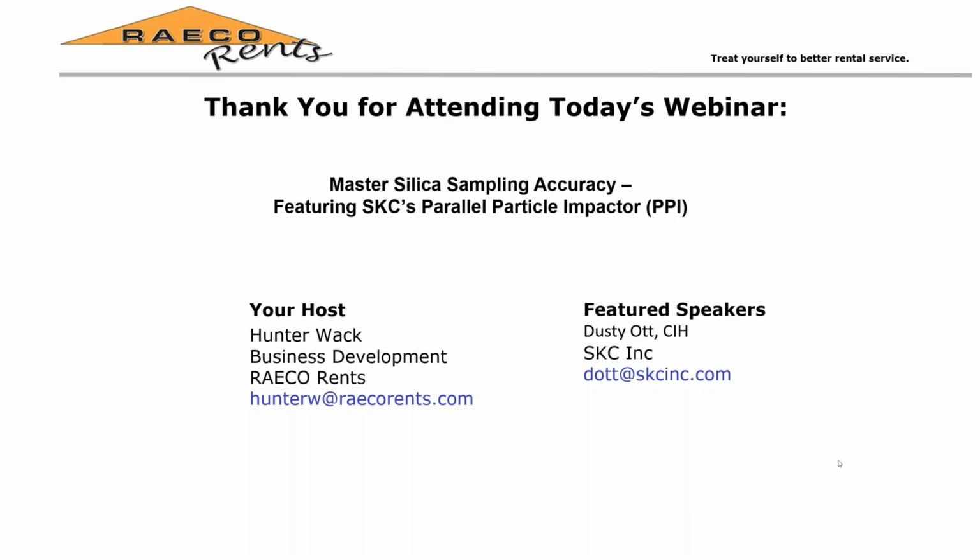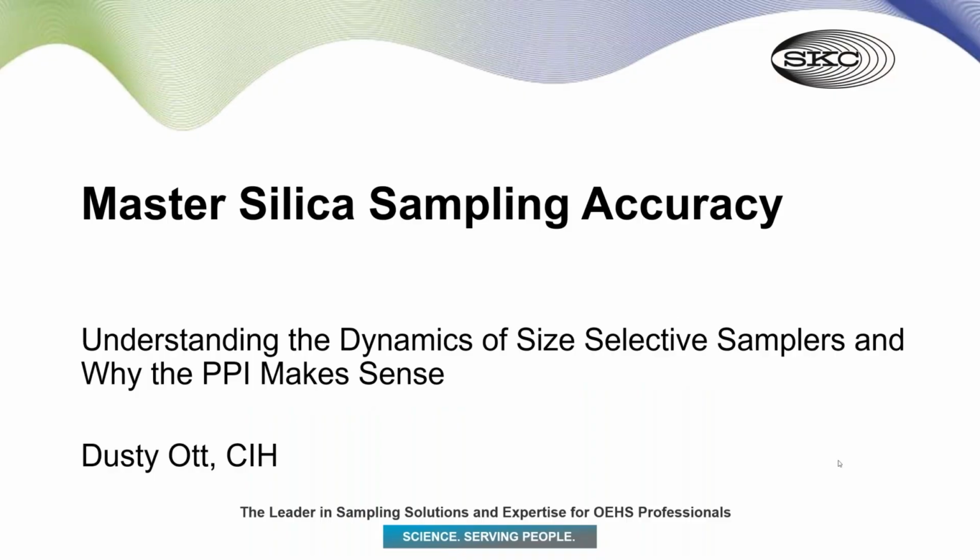Like Hunter said, we're going to be talking about the PPI. We're going to talk a little bit about cyclones as well and how they differ, where they're good, where they're not so good, what is going to be the best choice for you as you decide moving forward in your silica sampling. And so, kind of like the title says, understanding the dynamics of size-selective samplers.